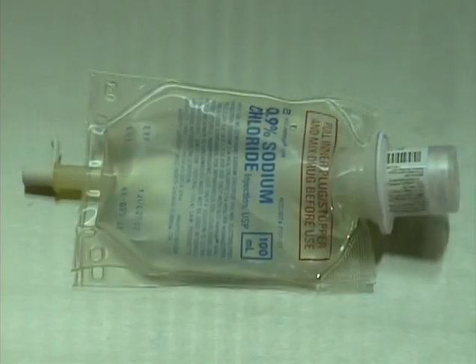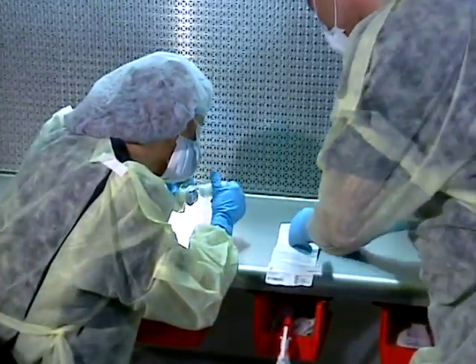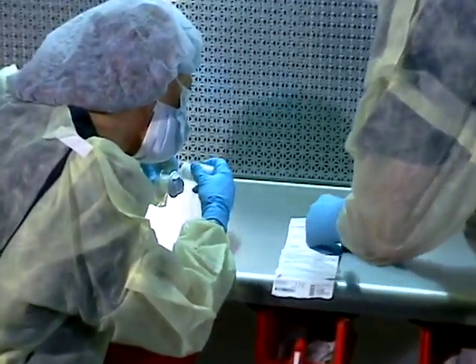You will encounter many other products and devices in your compounding practice. Try to apply the principles presented in this video when designing new compounding procedures. All new procedures developed should be written, and all personnel should receive training in new techniques.